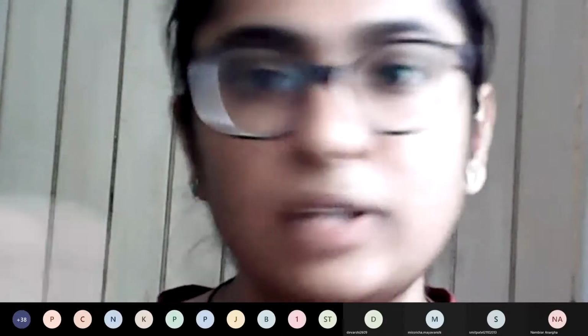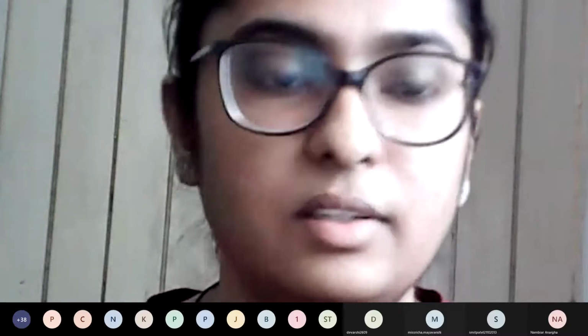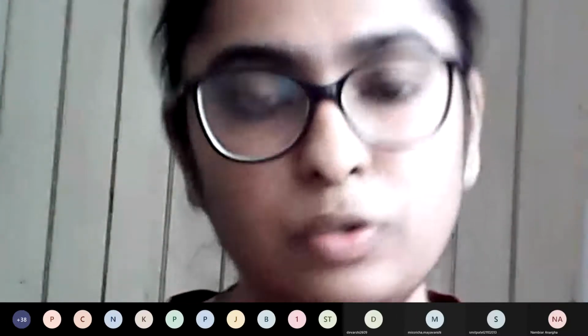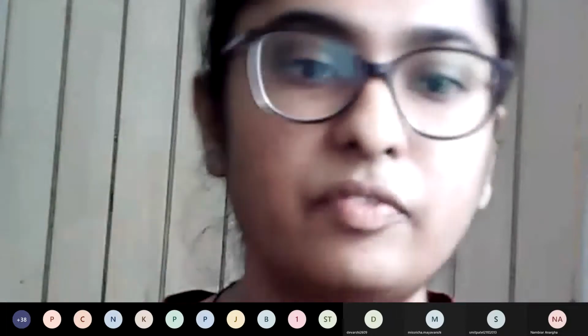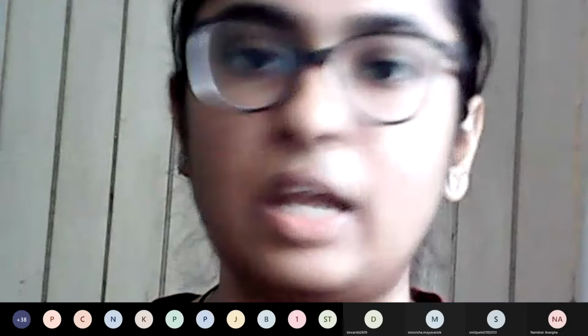So once you get that blue color, it means the titration is done. You have got your endpoint, and the first part of the titration is the mix.